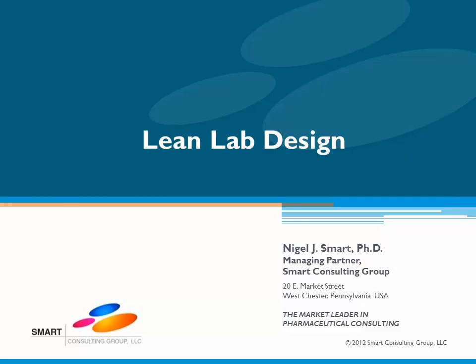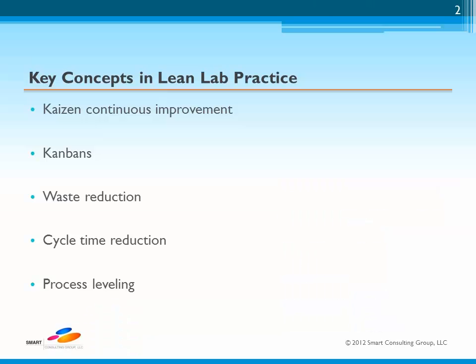process implementation. Some key concepts that we will discuss along the way involve applying lean principles to laboratory practices using Kaizen continuous improvement, Kanbans, waste reduction, cycle time reduction, and process leveling.